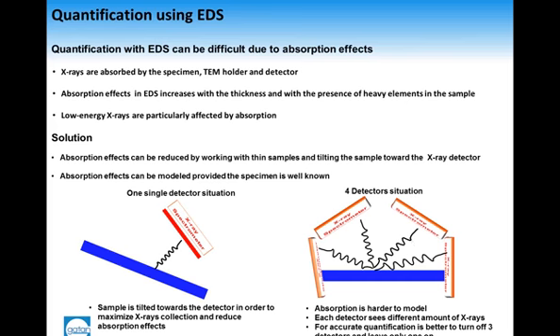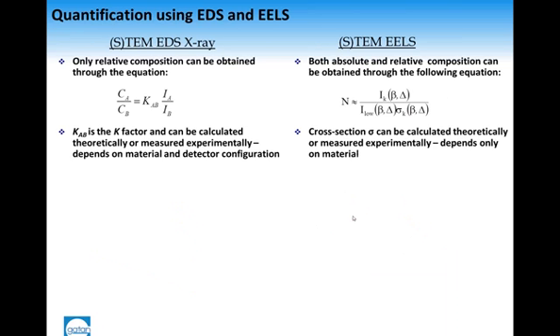So if you want to get a very good quantification, to improve the accuracy of our quantification using EDS in the situation of 4 detectors.